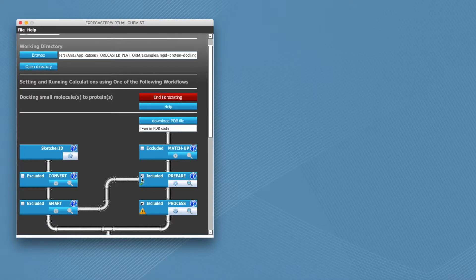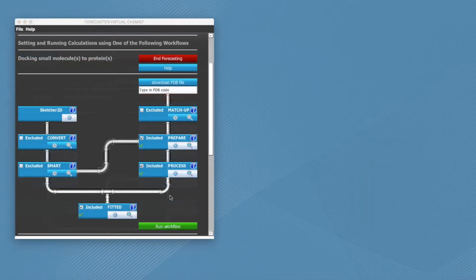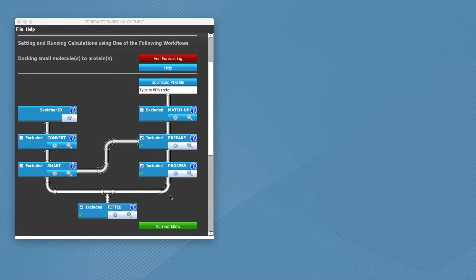You can now see a checkmark for this module, meaning that it is ready. Once all the included modules are ready, you can start your job.